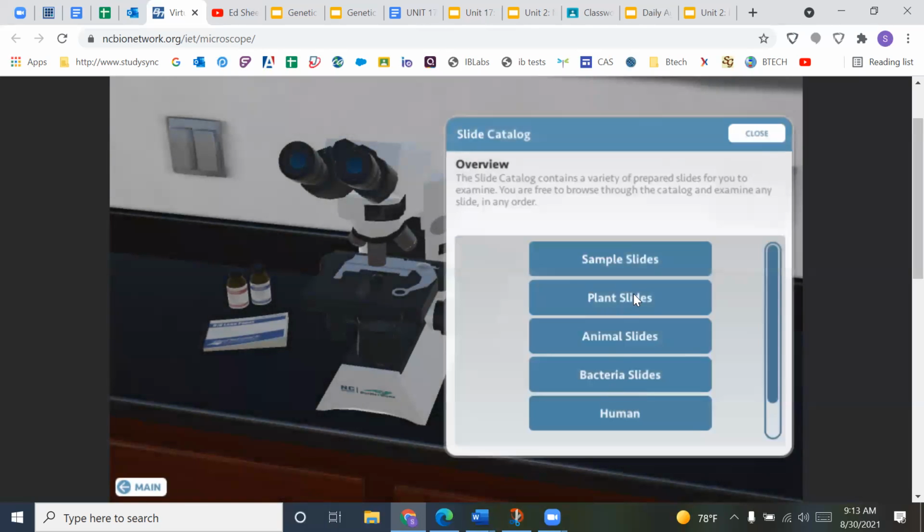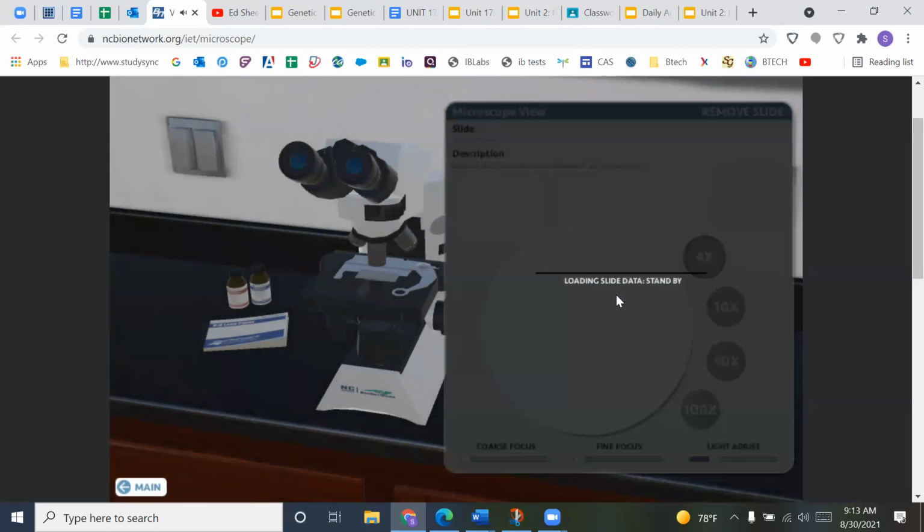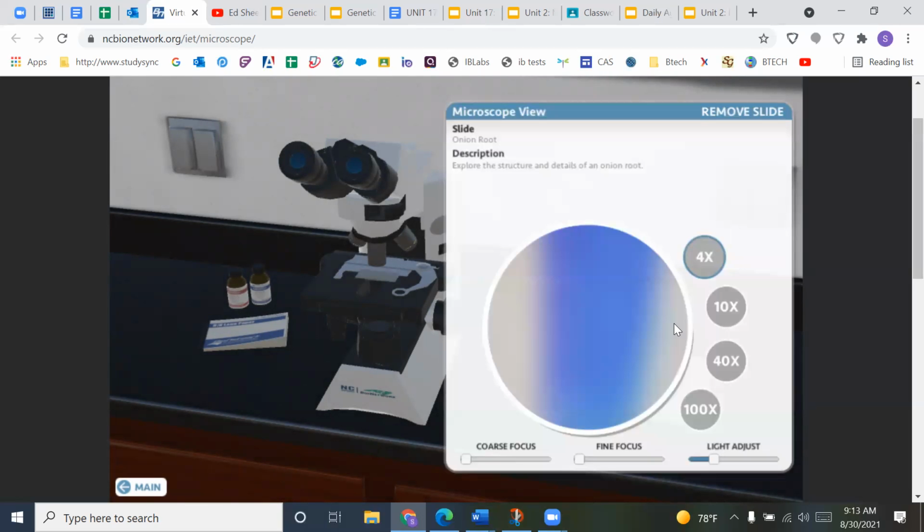I don't know if I told you guys this, but when you carry a slide, please pick it up by the sides. Okay? Please, everyone, look. I do not want you to put your fingerprints on the glass part. Okay? So you carry it from the sides like this.